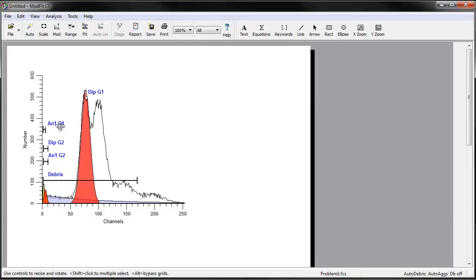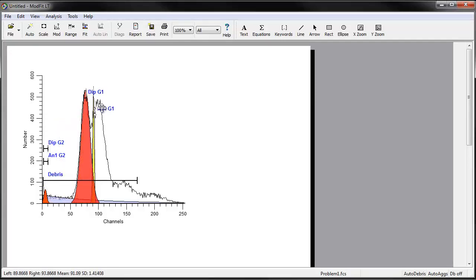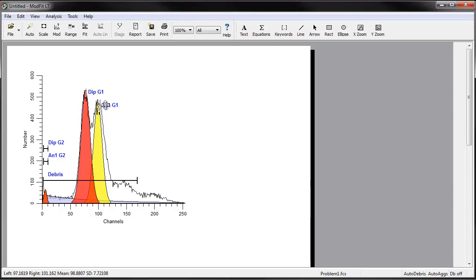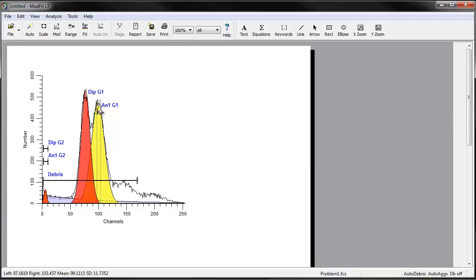Move the AN-G1 range over the center of the second peak, the DNA aneuploid G0-G1. This peak will fill with yellow to indicate the range estimate.